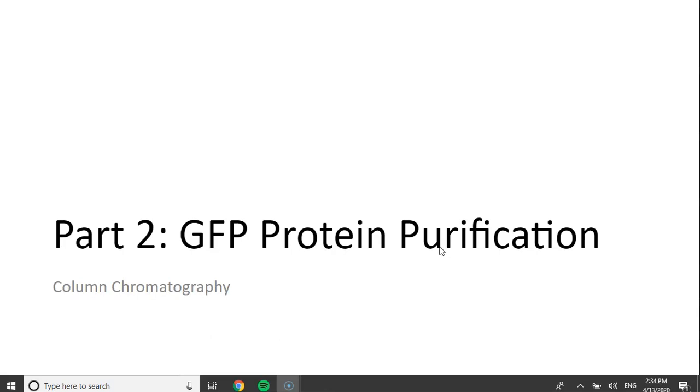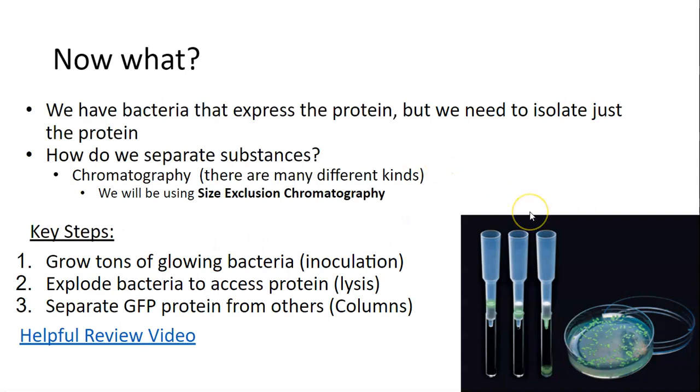So this process is called chromatography. And for us, there are many different kinds of chromatography. It's just a big fancy word that means a separation of elements of a mixture. So if you think about having a mixture of things, and if I said, organize it, you could do it in a number of different ways. There are size or shape or specific properties.